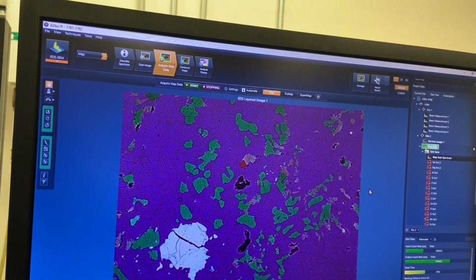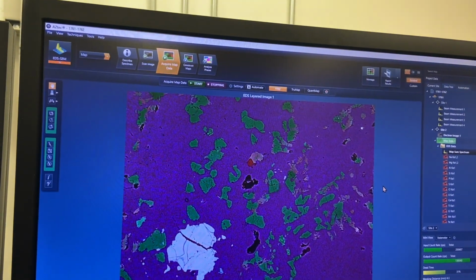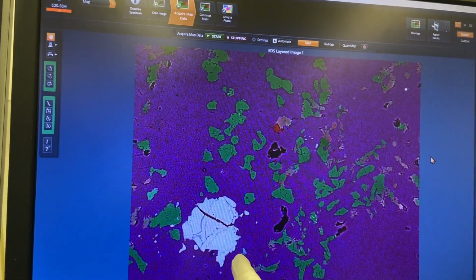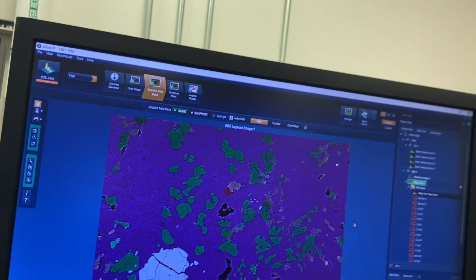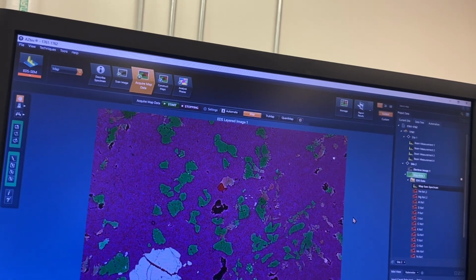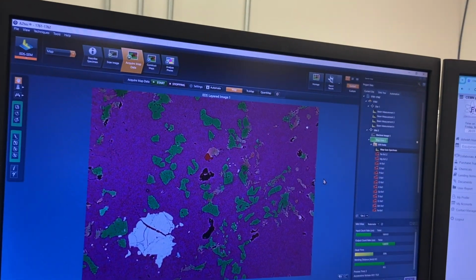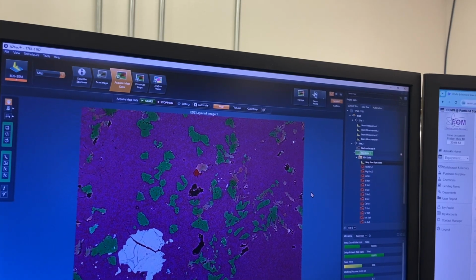All right, so right away, first observations, I see olivine, I see pyroxene with varying compositions, I see feldspar, I see some troilite in that little olivine right there. I think I see metal and chromite. I don't know what that is. That could be Novospino. This might be a lunar meteorite. That's my first guess, but you never know, right? Sometimes, looks can be deceiving. Even something like this can be deceiving, and you can even think it's a meteorite, but it ends up being something terrestrial.